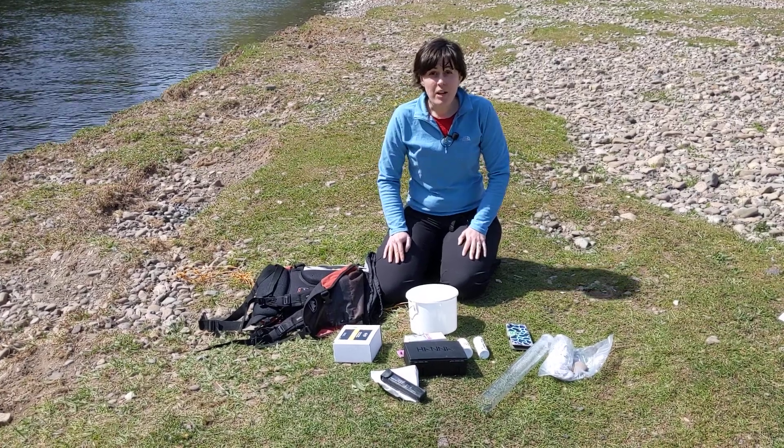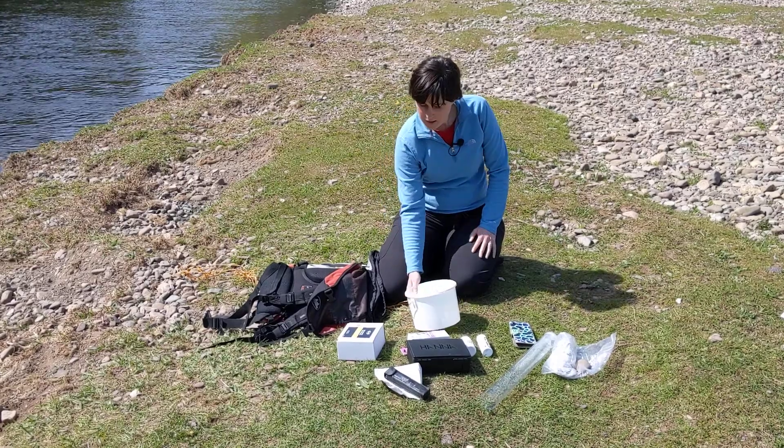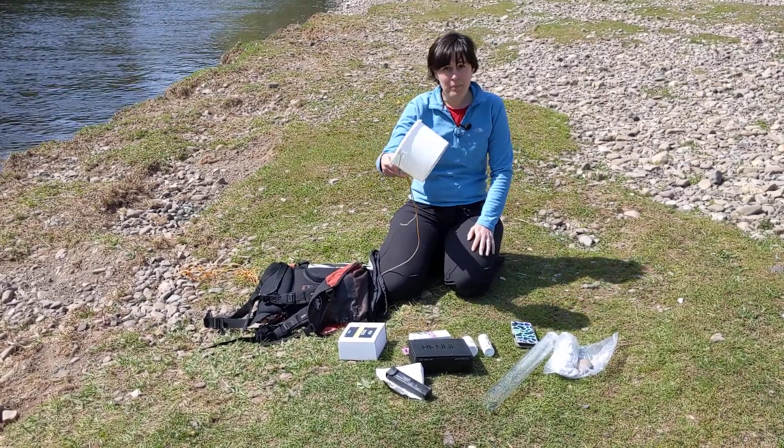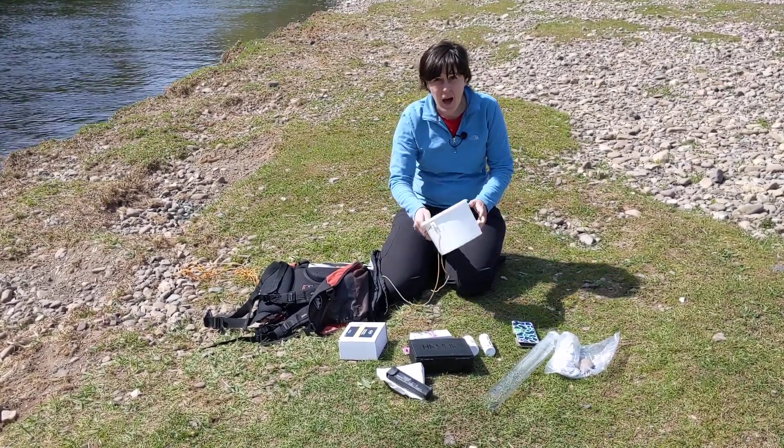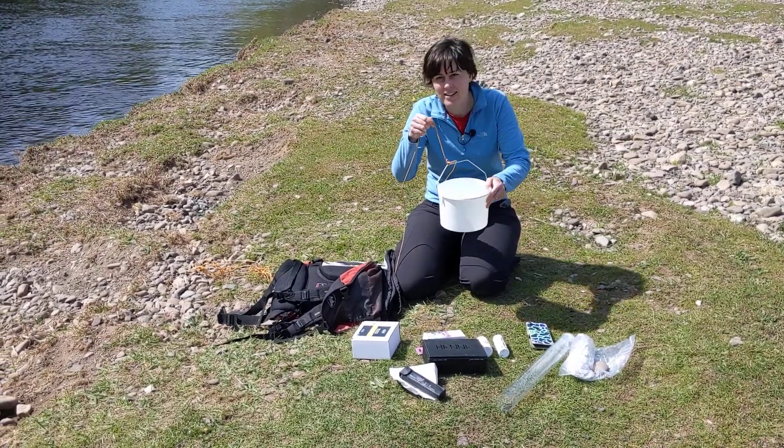When you're getting ready to go out and take your water samples, make sure you've got all the equipment you need. You need some kind of sampling device — a bucket, a beaker, a bottle. I like to have it on a bit of string just in case I accidentally let go of it.